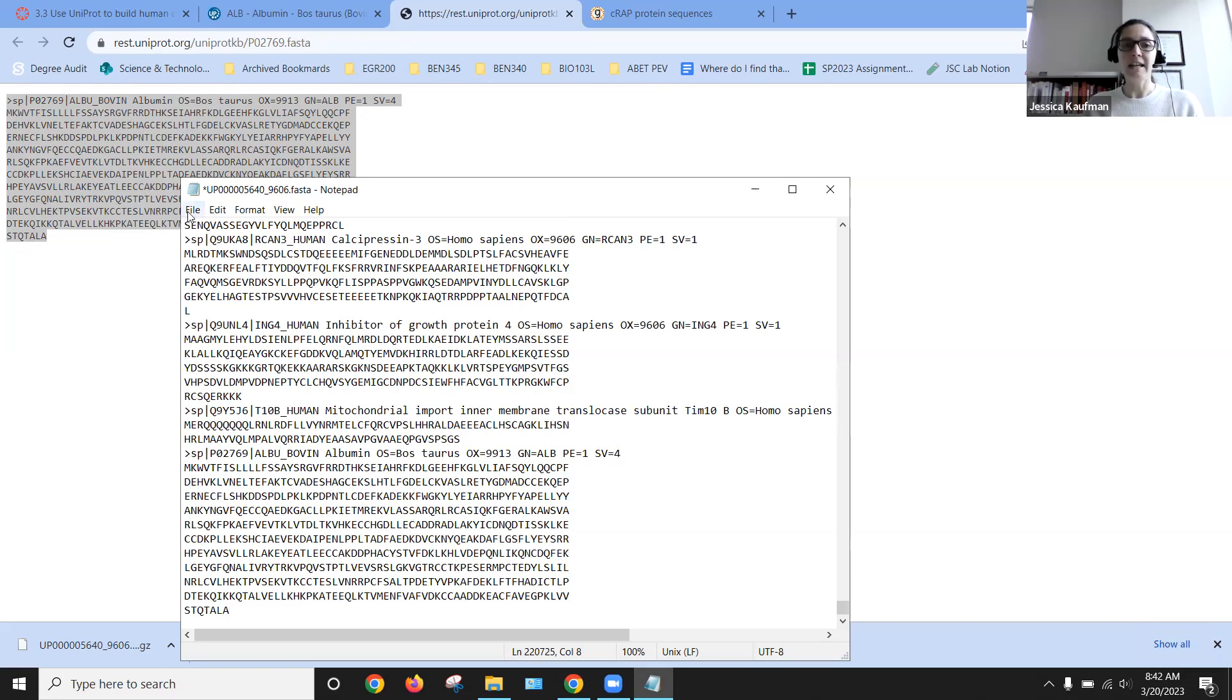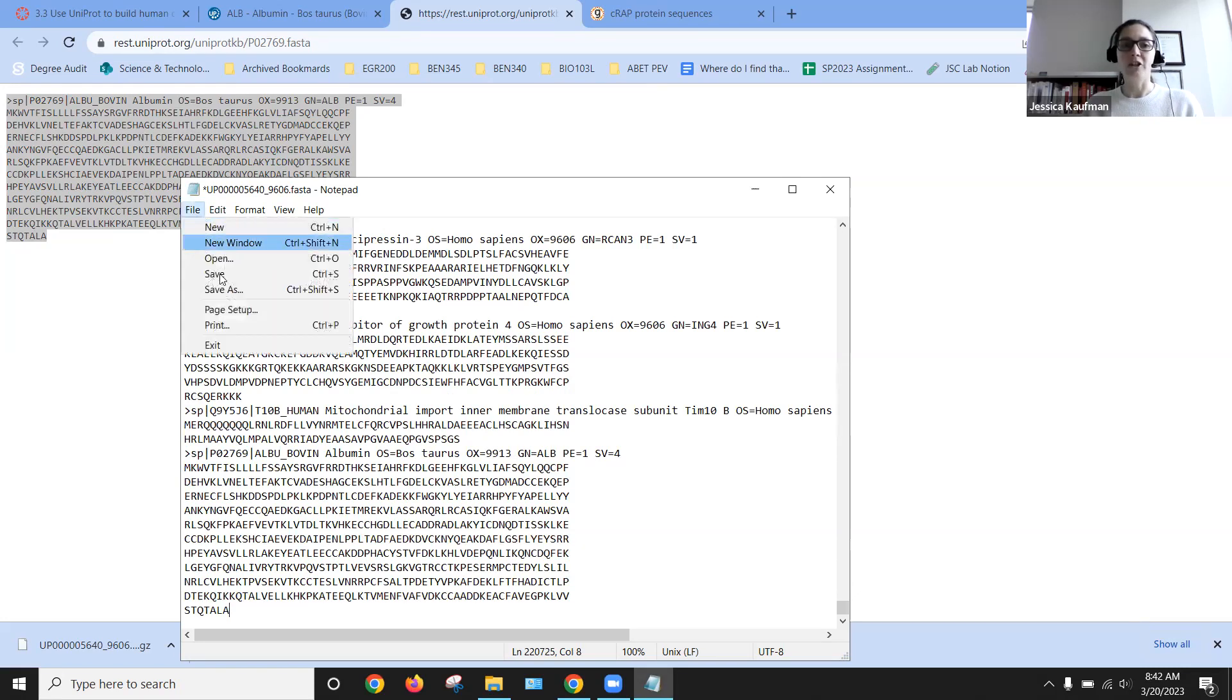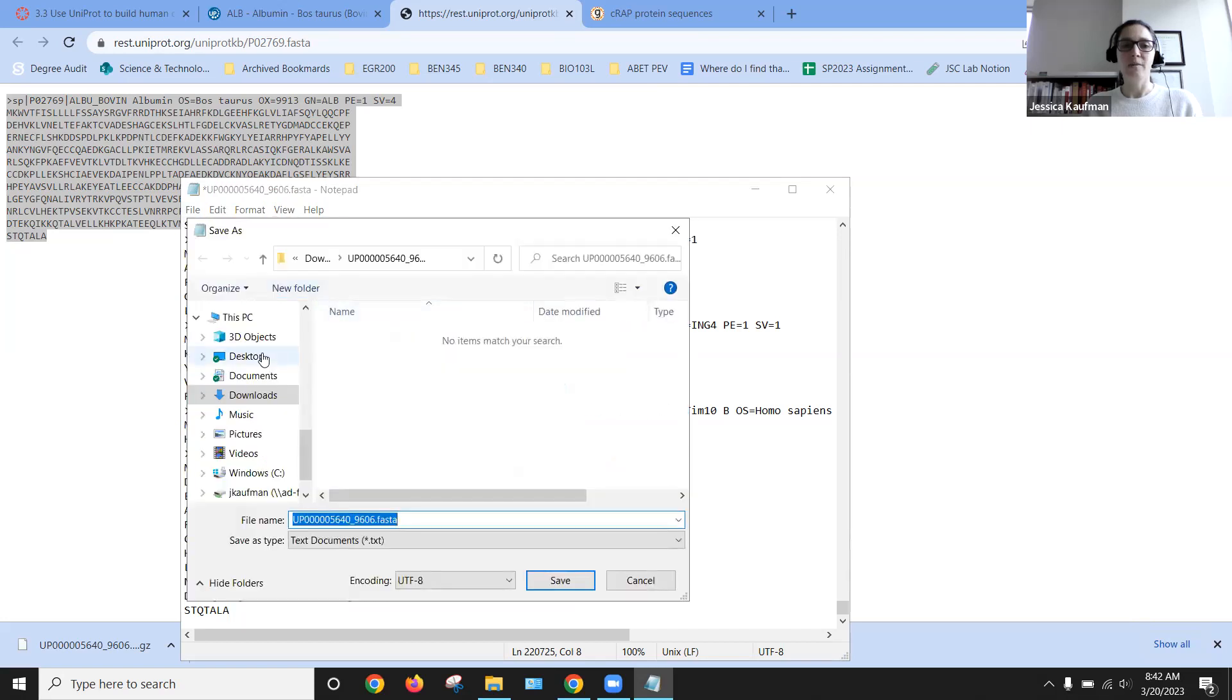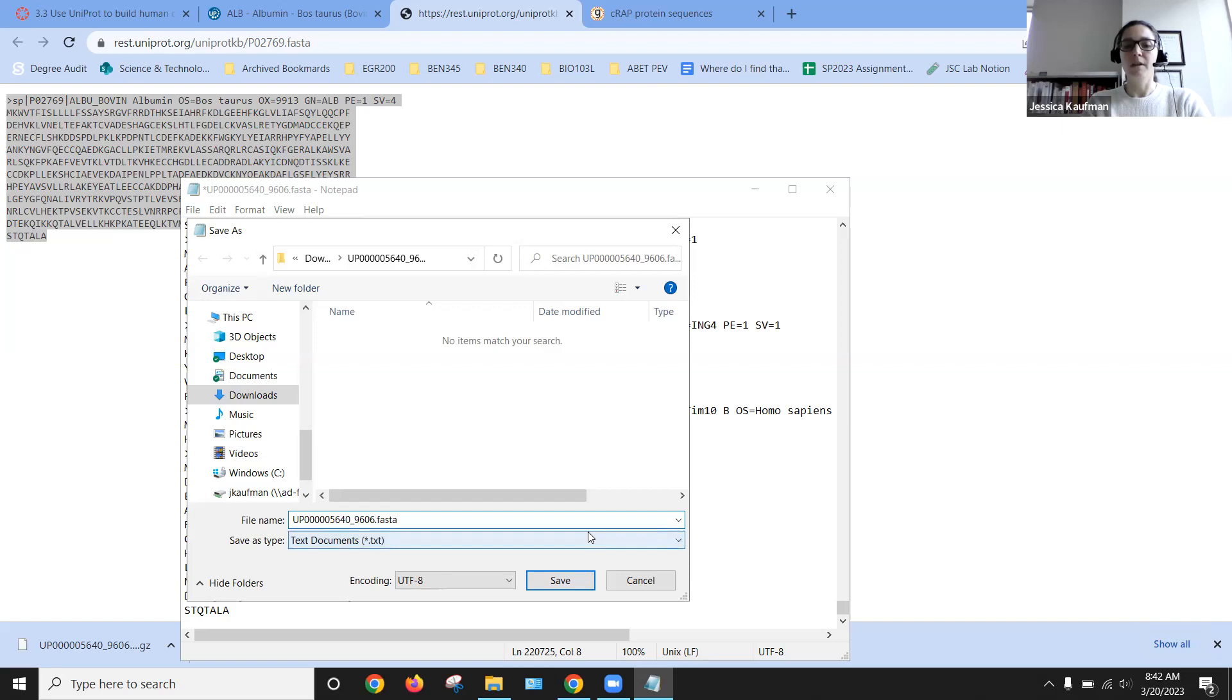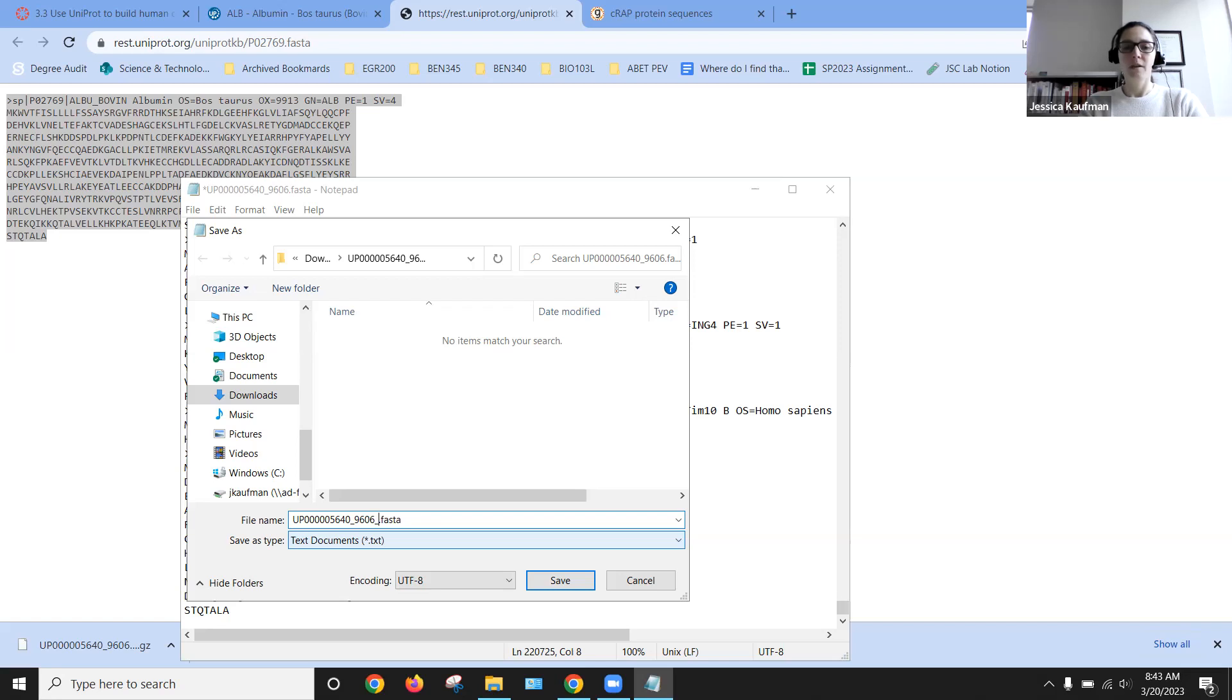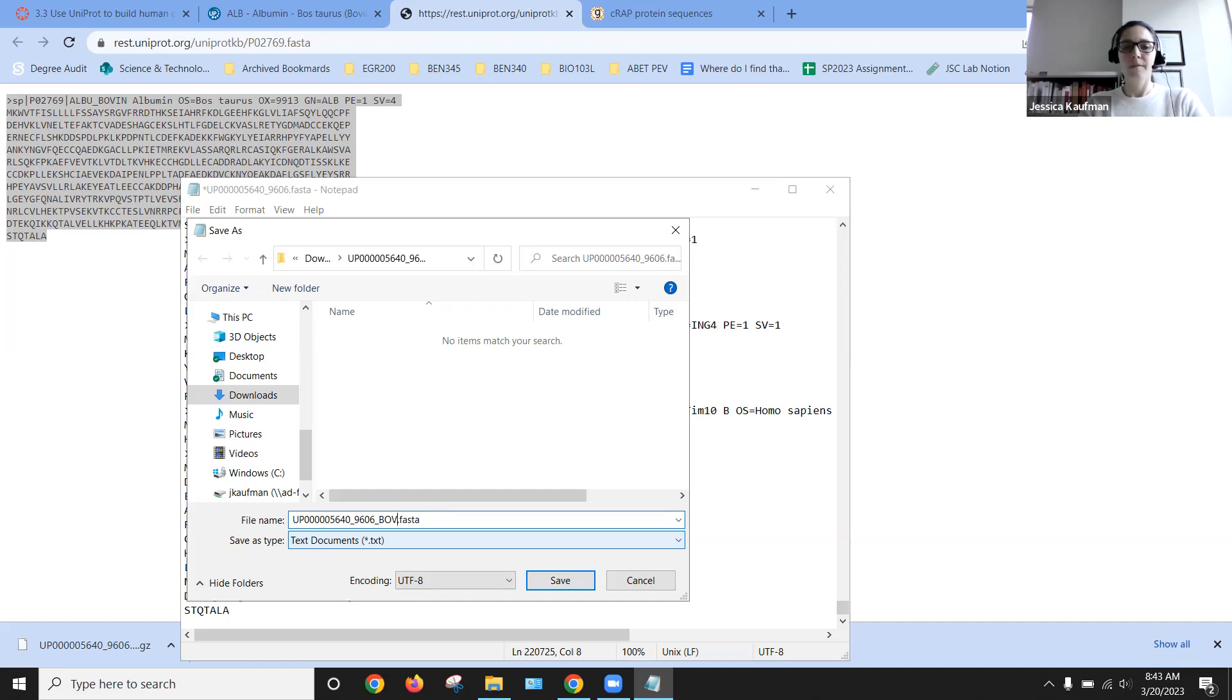Now that I've modified this, I want to change the name of it. So I'm going to save it to my desktop and I'm going to call it the name of the proteome, underscore, bovine albumin, and then today's date.